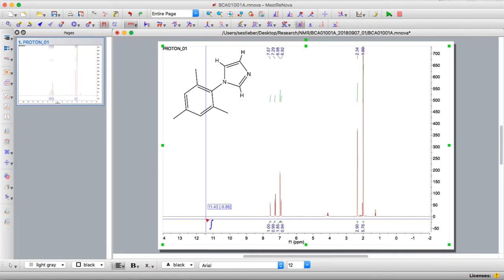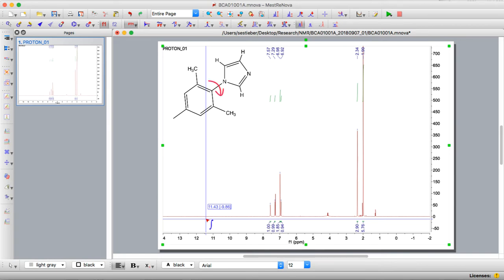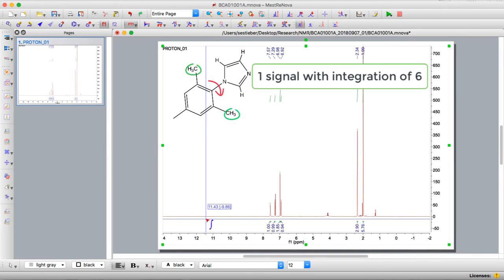If we now look at the mesityl, we see at the ortho position we have two methyl groups and those actually are related to each other because if the whole mesityl rotates around this bond those end up being equivalent. So from those we expect one signal that has an integration of six.